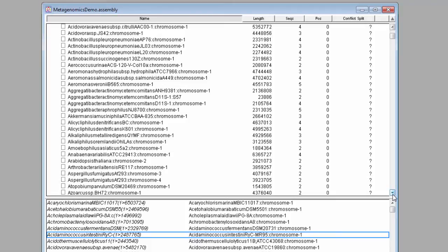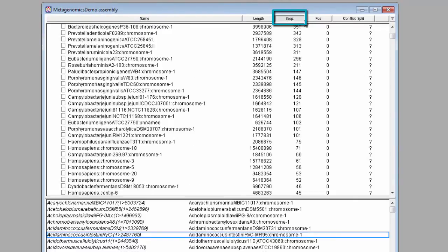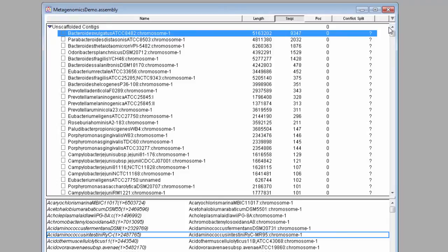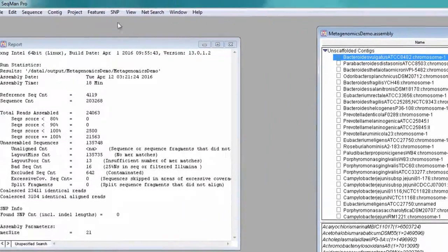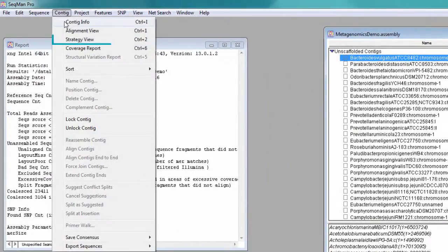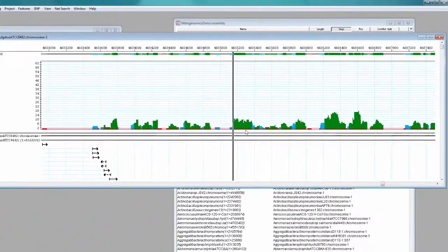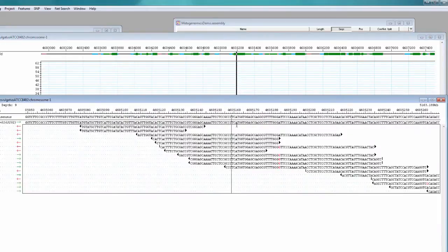These contigs can be sorted by length or number of sequences. If we sort by number of sequences, we can see which bacterial strains are most abundant in the sample. I can then view these contigs in more detail using the strategy view and the alignment view.